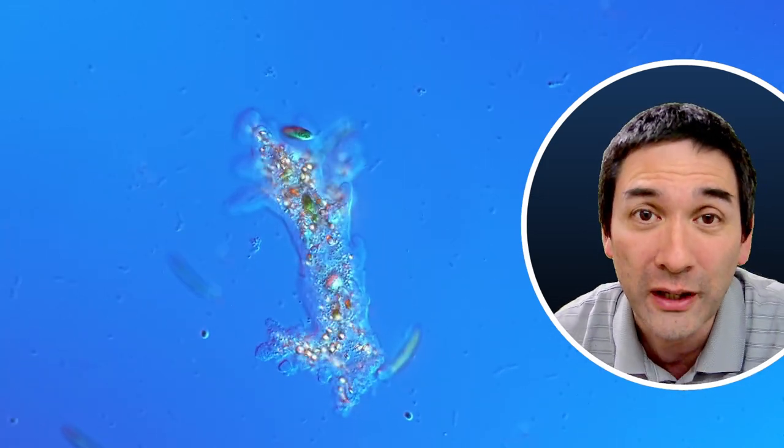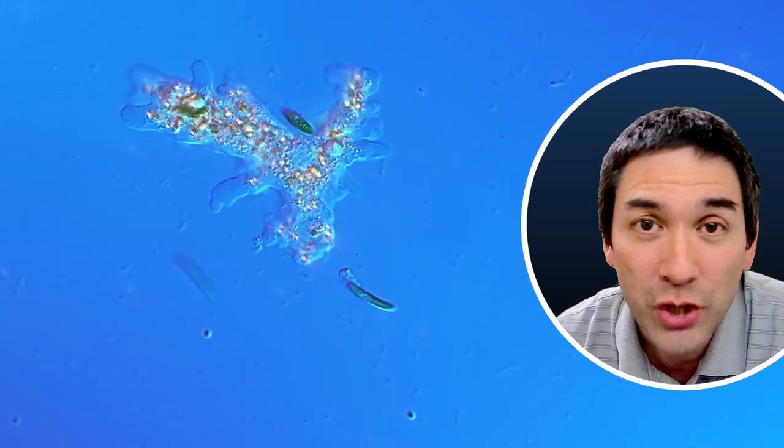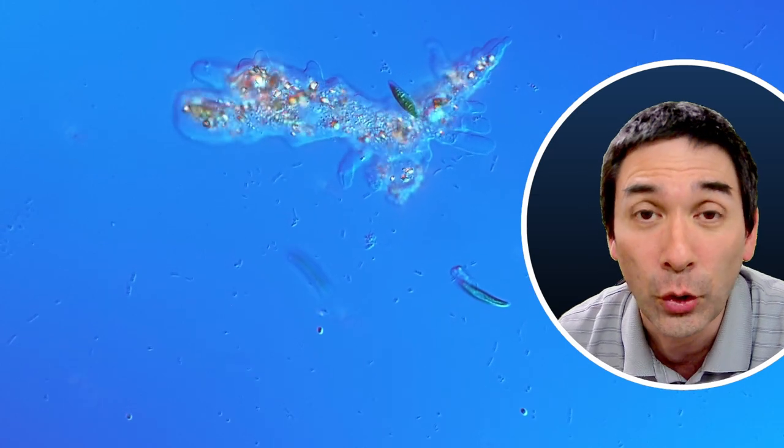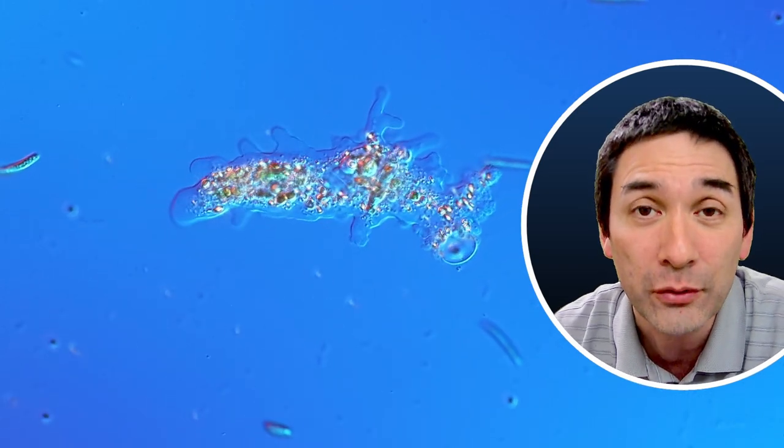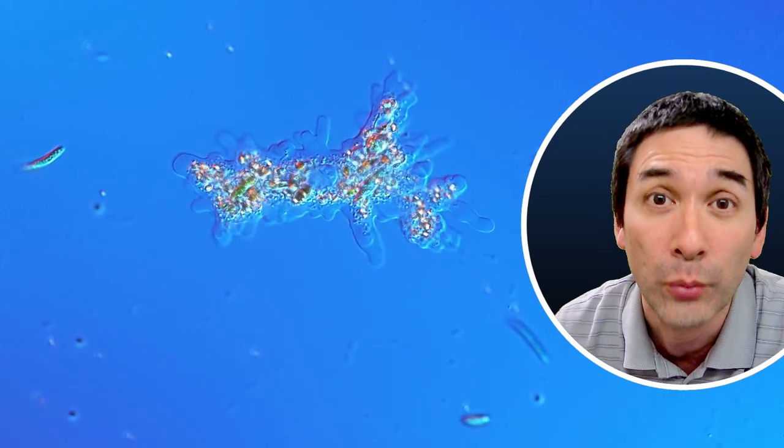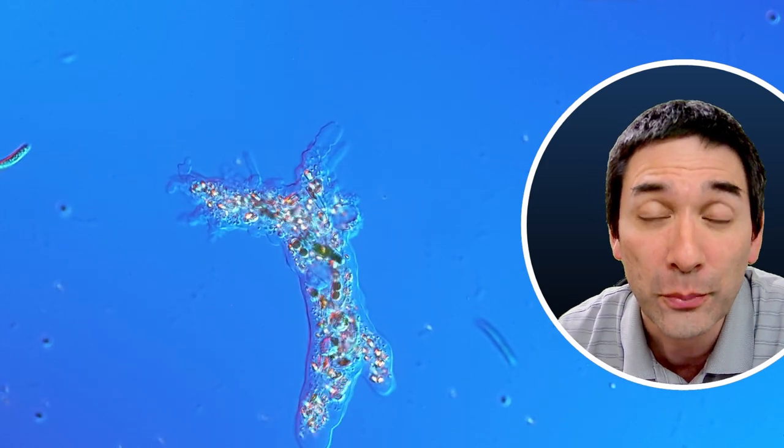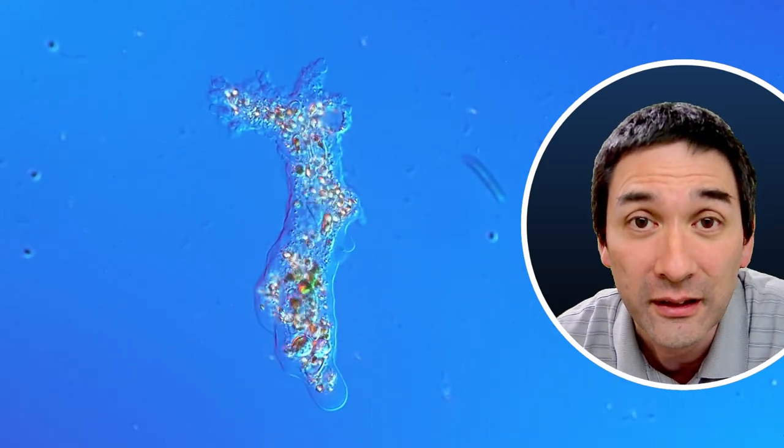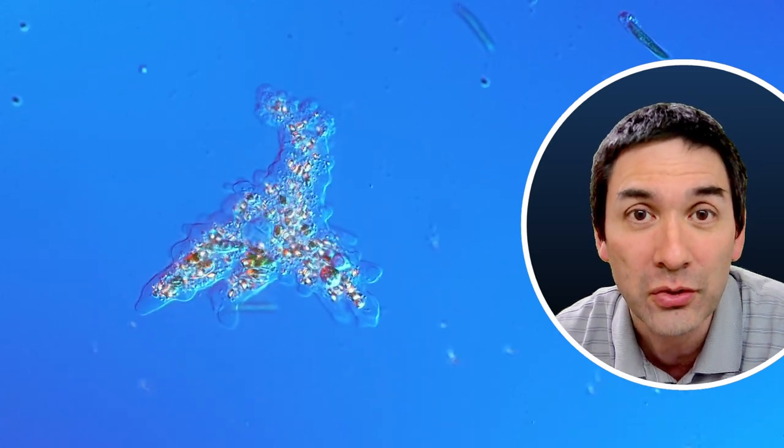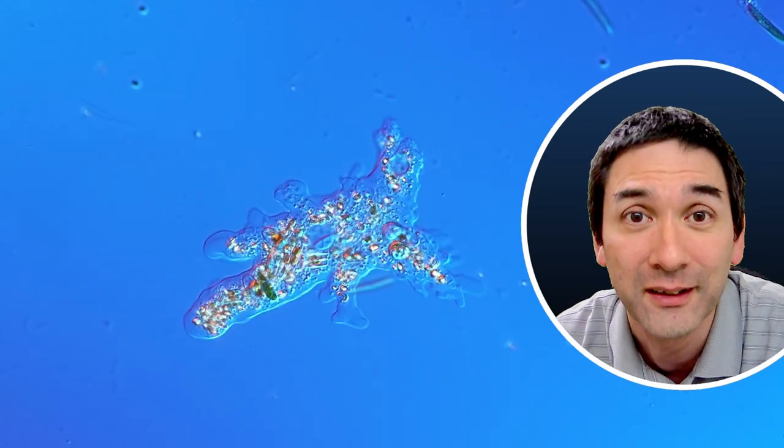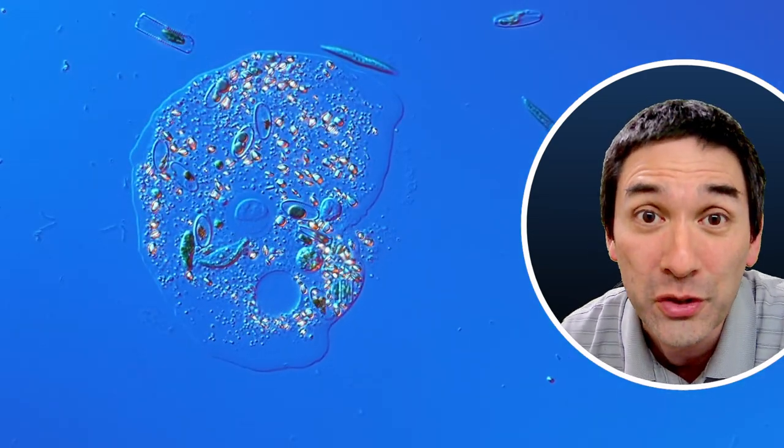This amoeba was moving around hunting for food and changing its shape as it's moving along. However, as the time passes by the water under the microscope slide started to evaporate more and more. And the cover glass, which is on top of the amoeba, started to press down on this little creature more and more. And this caused the amoeba to become compressed and squashed and even to pop open. And this is something I'm going to show you here.